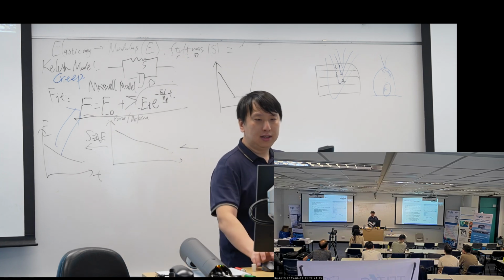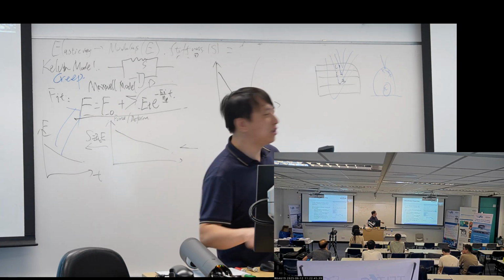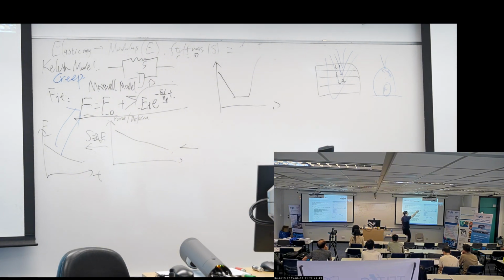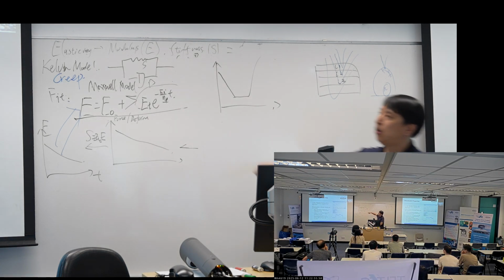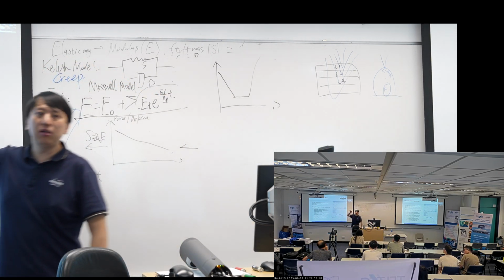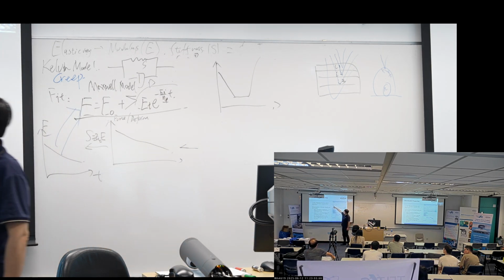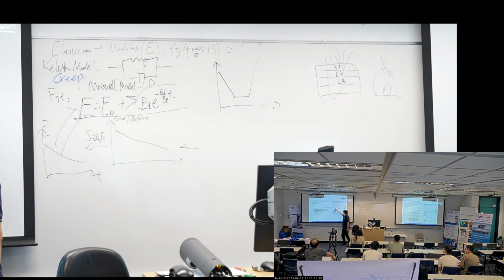As such, Bruker provides different options, and in the script I show here, we provide 6 options. The first option is moving down until I reach a certain force. The icon looks something like this.